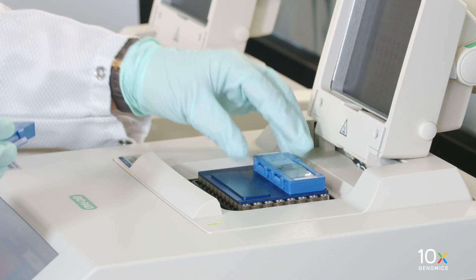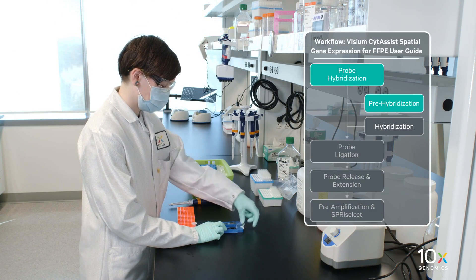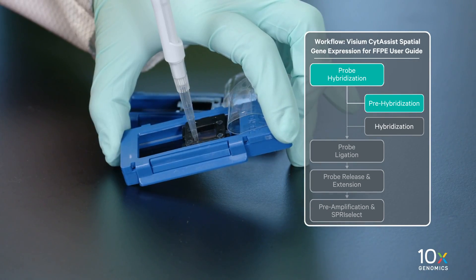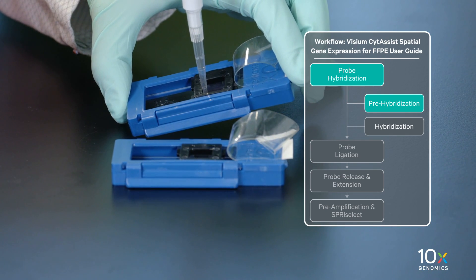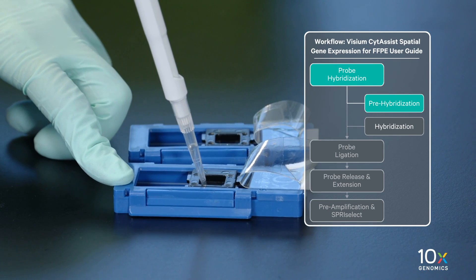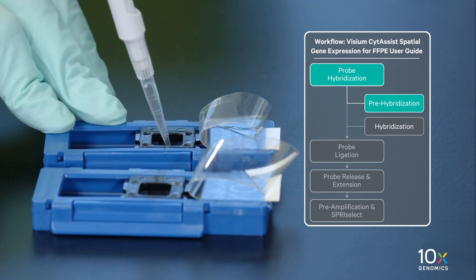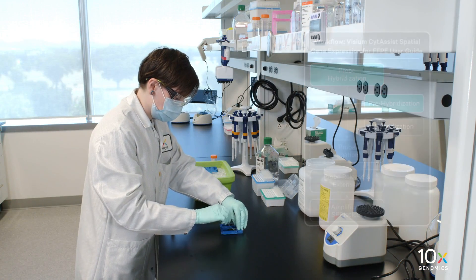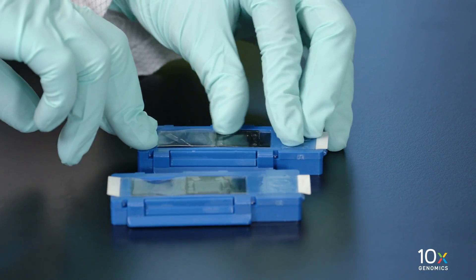Retrieve the tissue cassette containing H&E or IF stained sections and peel back the Visium slide seal. Using a pipette, remove all of the buffer from the well corners. For an H&E stained slide, remove all of the decross-linking buffer. Add 200 microliters of pre-hybridization mix along the side of the wells to uniformly cover the tissue sections without introducing bubbles. Reapply the Visium slide seal on the tissue slide cassette and incubate for 15 minutes at room temperature.